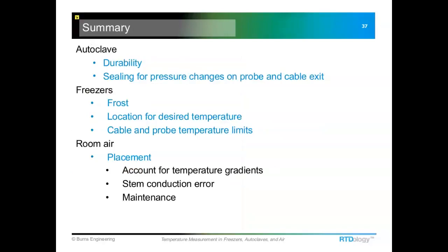And with that, I guess I'm all wrapped up here. Just kind of wanted to repeat again, especially for autoclaves, durability and sealing for pressure changes is hugely important. Freezers, pay attention to the liquid water. Make sure the temperature probe is completely waterproof, that your cable and the probe are suitable for the cold temperatures.